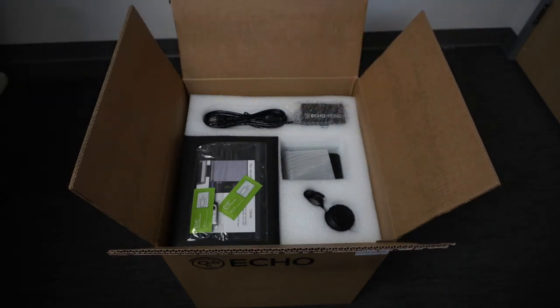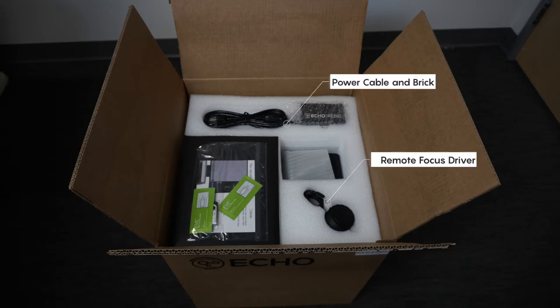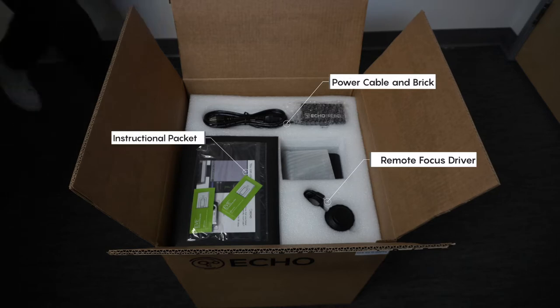There are multiple layers in this box. The first layer will contain your remote focus driver, the power cable and power brick, and the instructional packet in a black envelope.